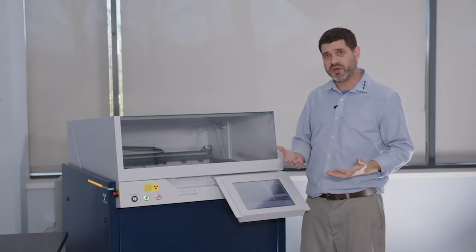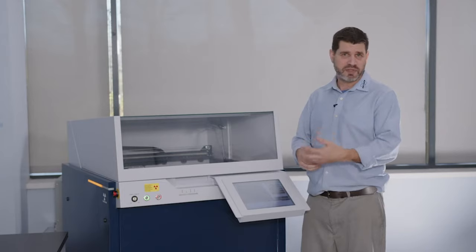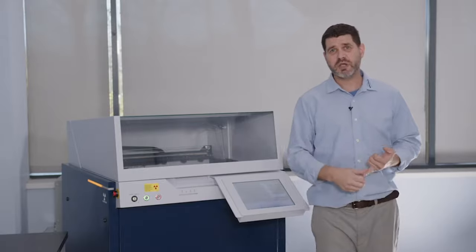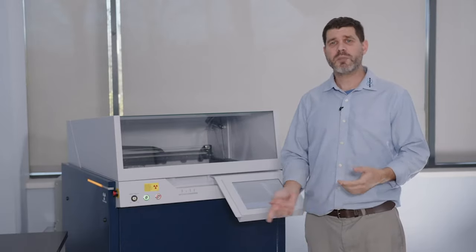Basically, to run a sample on the system, you put it into one of the sample cups that you see here, and you type in the sample ID name and press start. Sample preparation is very easy to do as well. So if you want to make a sample, you can run it as a liquid, you can run it as a loose powder, you can make it as a fused bead, or even press it into a pellet. So let's go back to the sample prep lab, and I'll just show you examples of each one of these sample preparations. Come with me now.